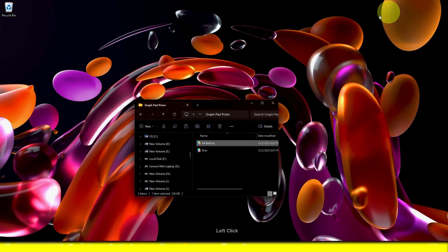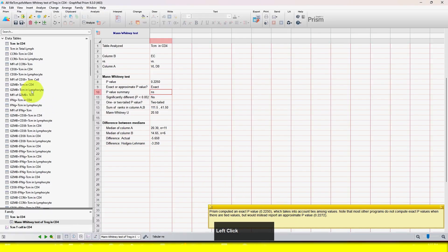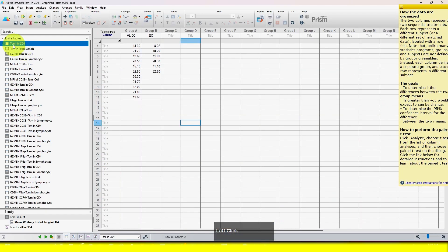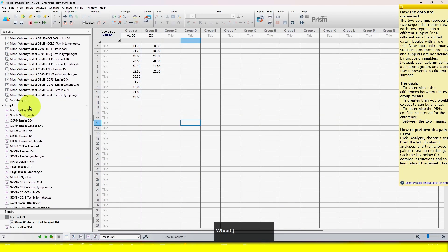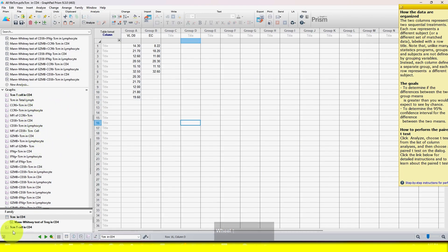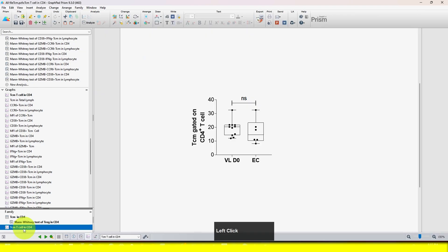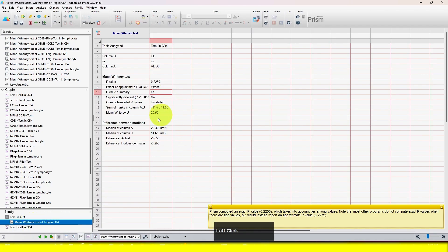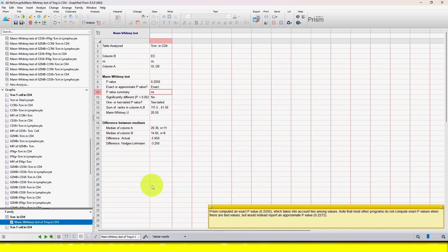Let me show you in the file that has multiple files. If you scroll down to get the graph file, you have to scroll down quite a bit. But if you just go to the Family section and click on graph in the Family panel, you will see the associated graph immediately. And if you click on the result file in the Family panel, you can see the result. This is a very good option — if you are not using it, try to use it, as it will save you lots of time.